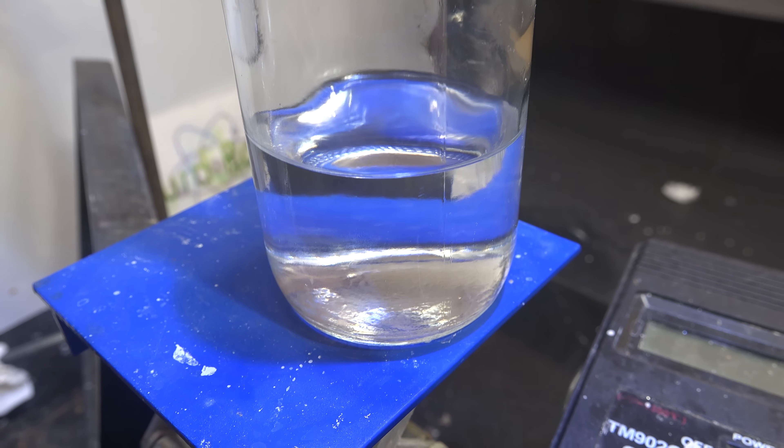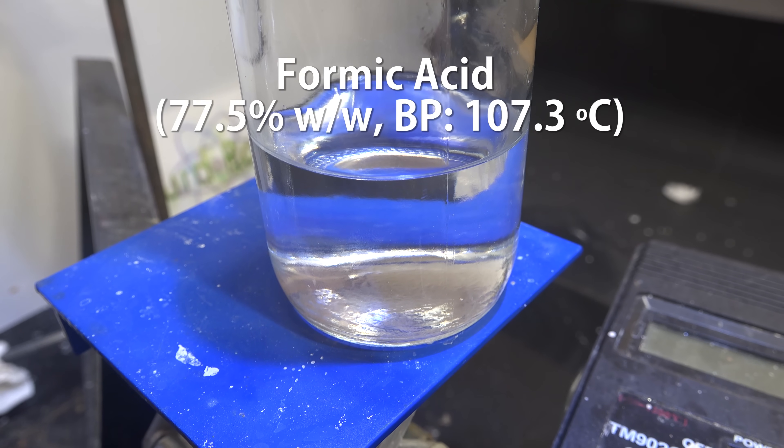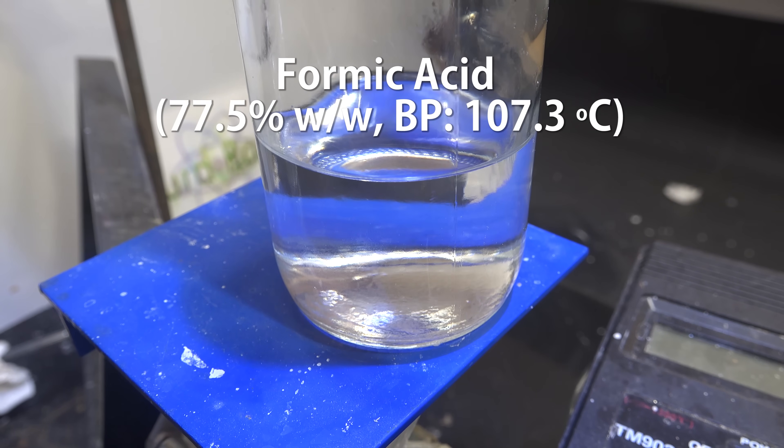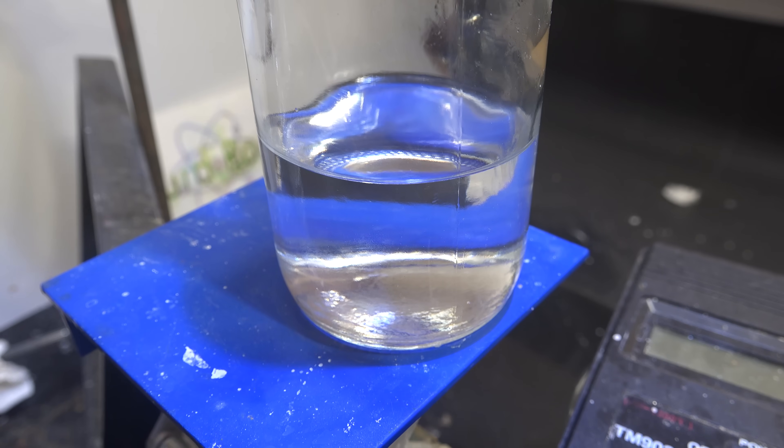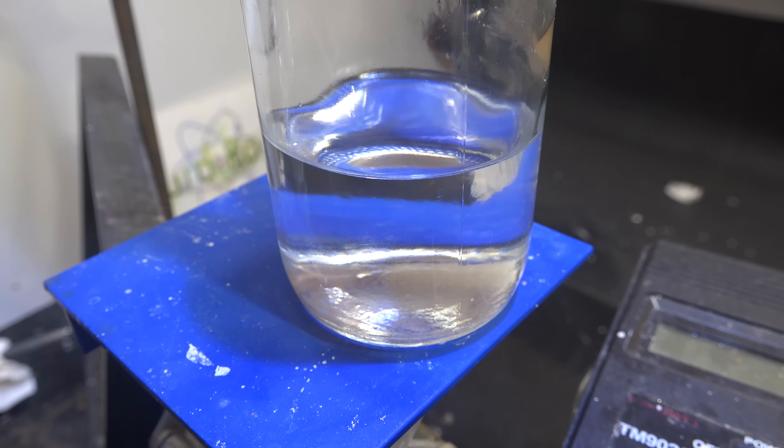And there you have it, an azeotropic mixture of 77.5% formic acid and water. Now some of you might want to dry it further and get pure formic acid but I recommend against that.